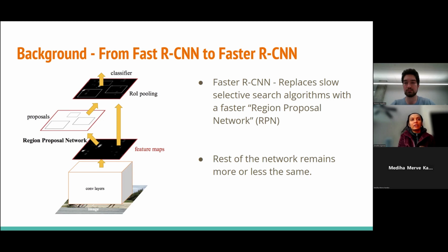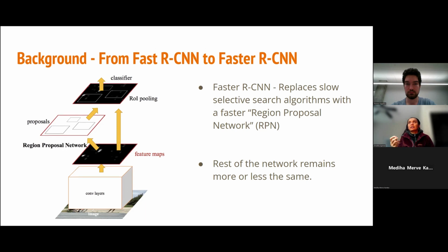Okay. Yeah, because this is kind of important information when you select your data. In R-CNN and Fast R-CNN, you have bigger objects where you can literally point out cars and these things based on their bigger sizes. But think about smaller objects. In our case, we have little voids, little black dots, that you saw in Mask R-CNN. Knowing the right algorithm, what it is picking, helps you choose the correct model, especially for those kinds of features. On what basis is it proposing that this is an object?